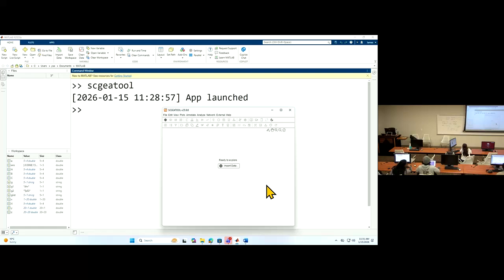Create analysis. Oh, you select the library. Yes, universal gene expression. Should be this one. Oh, you need to select this so it knows. Whatever you can type in, then select red. Yeah, red. No, that's human. Uncheck this, it takes too long. You need a name.